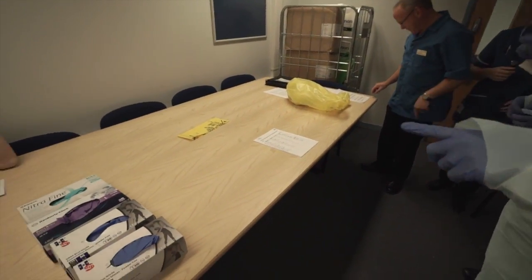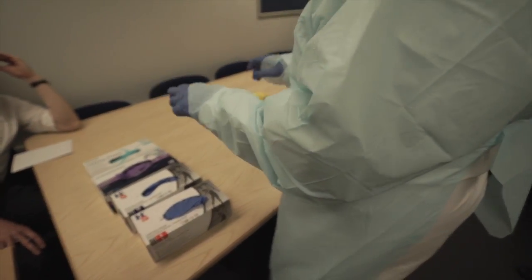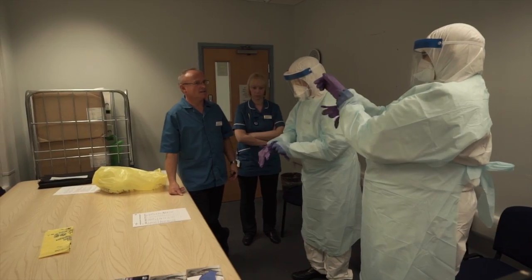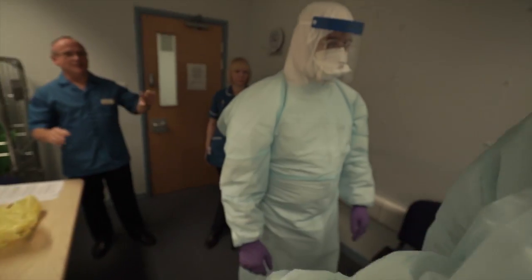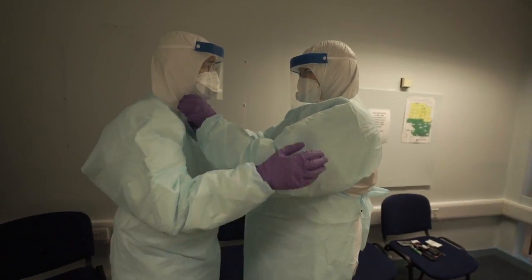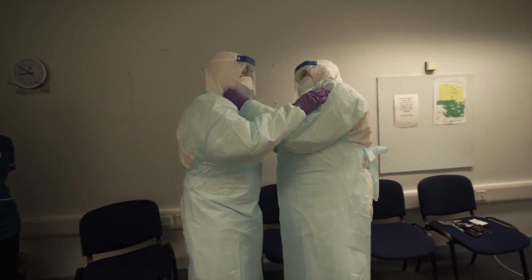The next thing is to put on the second pair of gloves — either the same size or the one above. We need to look at your apron here because it's not quite doing what it should do, is it? A bit of the suit needs to go over. That's it, and then you can actually tuck that.